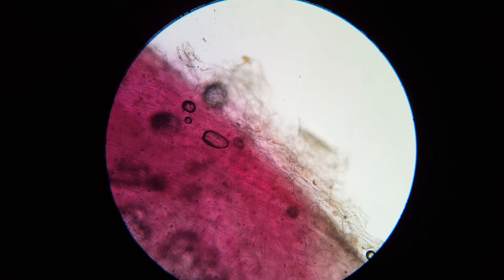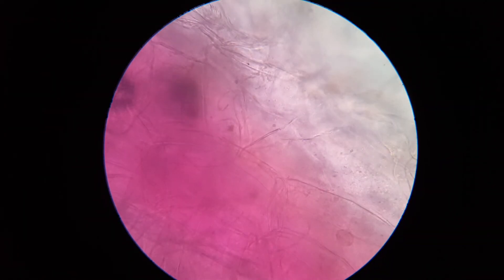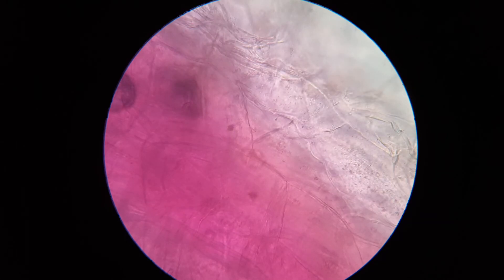We can already see cell walls for sure. This is suspended in a little bit of iodine, which might give us a little bit of contrast.